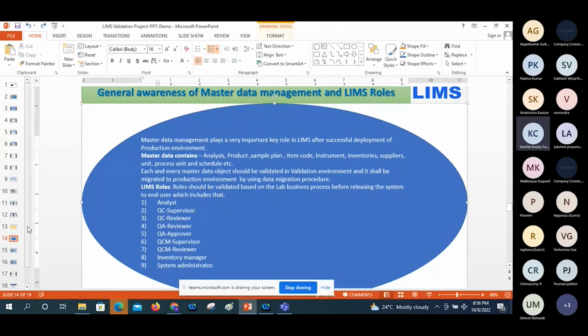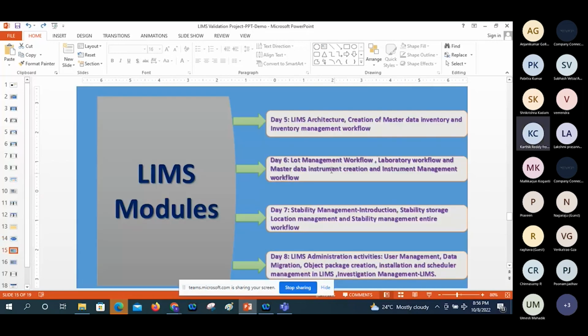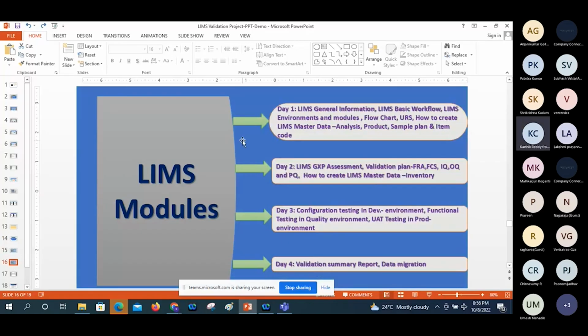So if any issue or some errors are happening, he can get, by writing ad hoc query managers, the relevant information on why the error was happening in the system. And once you are attending the application, tomorrow the LIMS modules can be started from day one.